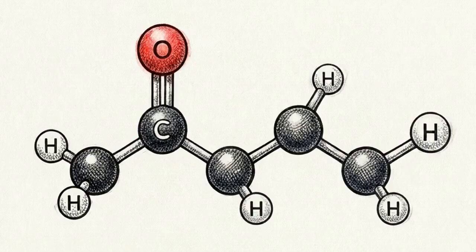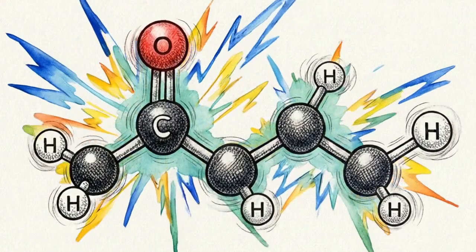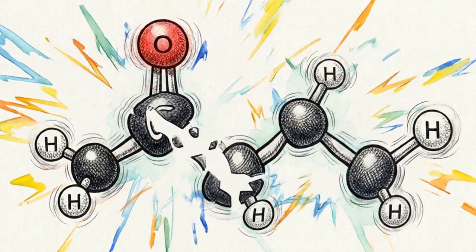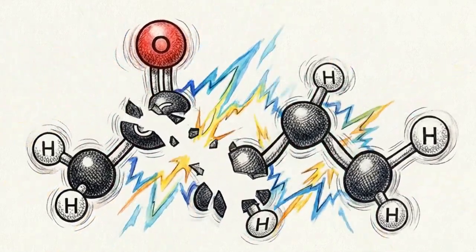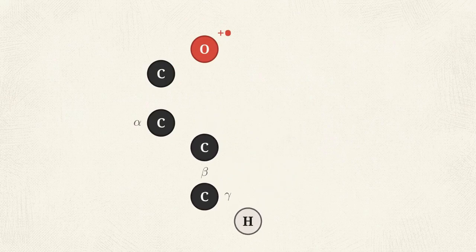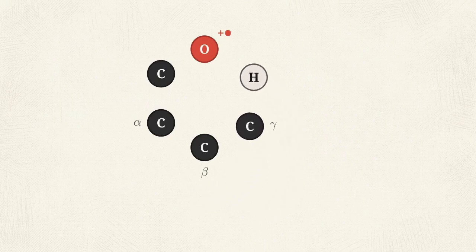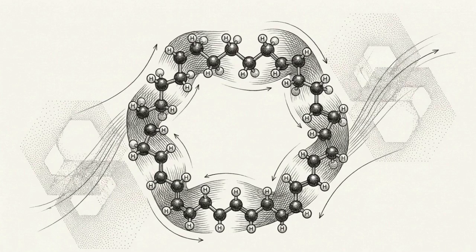This state is temporary. The radical cation possesses tremendous excess internal energy. Within microseconds, it will snap apart to relieve that stress. Yet in that microscopic window of time, the molecule is a physical object with moving parts. Its carbon bonds can rotate. If the chain is long and flexible enough, it can fold back on itself, allowing the reactive head to collide with its own tail. This self-reaction is called the McLafferty Rearrangement.